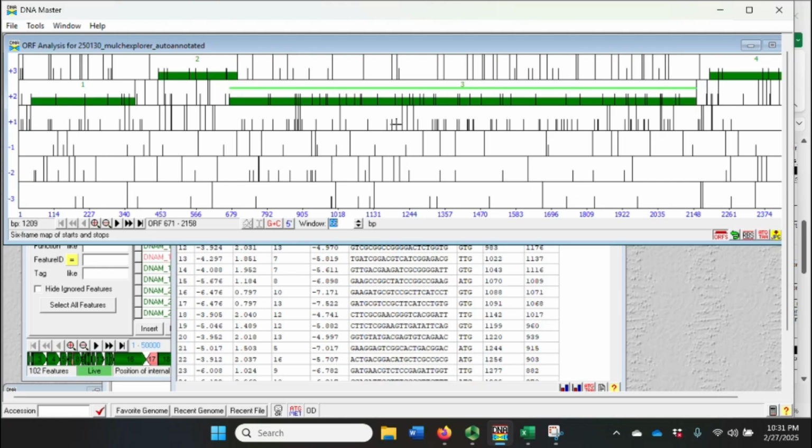And so, again, same way we don't want to waste coding potential, but not quite to that extent, it's a little bit unlikely to cut off significant portions of an open reading frame where you have this statistically unusual low amount of stop codons, or a region free from stop codons.